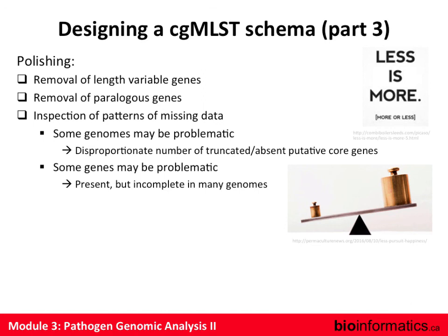With whole genome sequence data, there are ways to evaluate how good these schemes are. And hopefully, as a scientific community, we will do a lot of that testing to see which ones are better. There are 4 schemes for listeria. Which one's best? We can tell. There are ways to do that.